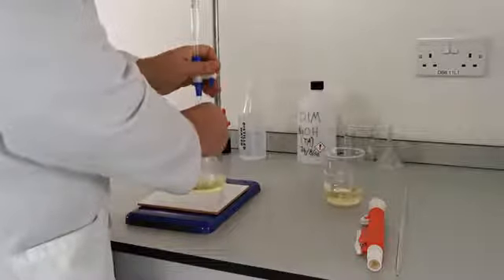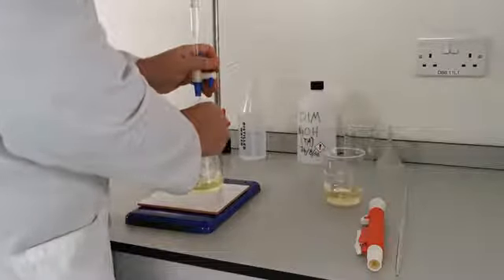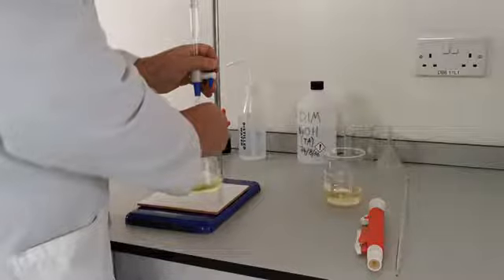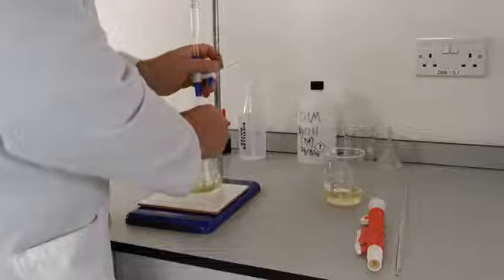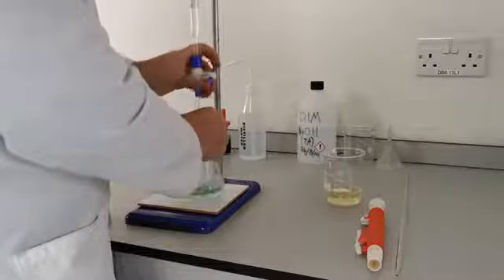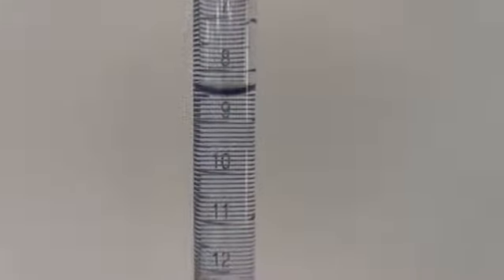As you approach the neutralisation point, you'll see the solution start to change colour. At this point, add the sodium hydroxide dropwise. Once you see a blue-green colour, stop the titration and take your reading.